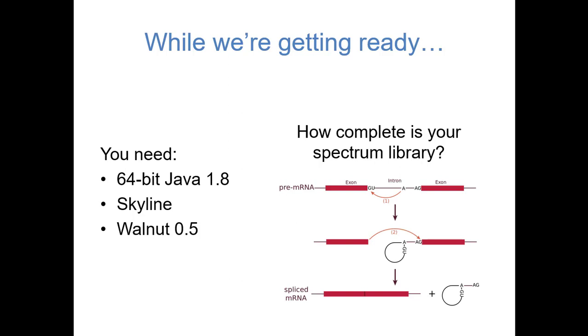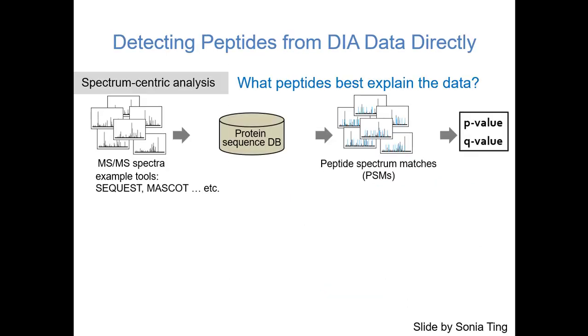Sometimes, basically, you just need to make detection straight from a FASTA, or straight from genomic sequence. For example, splice variants might be one, or splice sites if you wanted to measure peptides that span splicing domains. There are a bunch of other reasons why you might not actually have an MS2 already for your peptides of interest. Okay, so to do this, we have been working on and published last year a project called Pecan, which is peptide-centric analysis straight from FASTA databases.